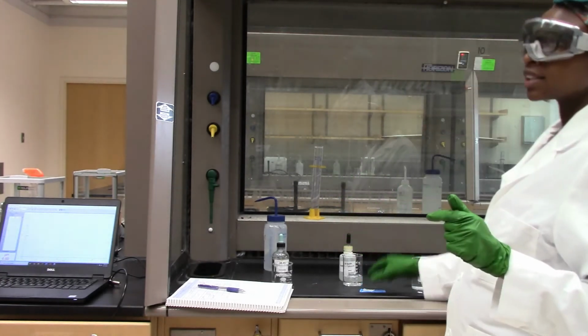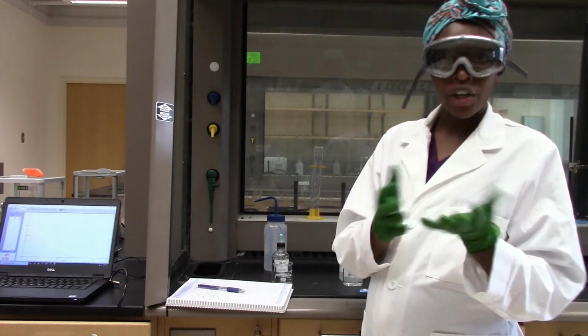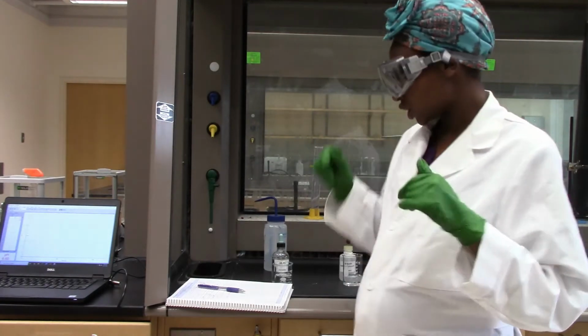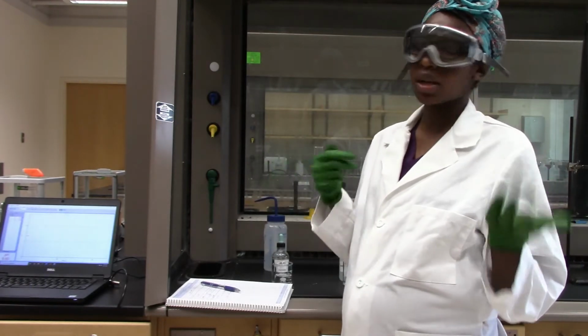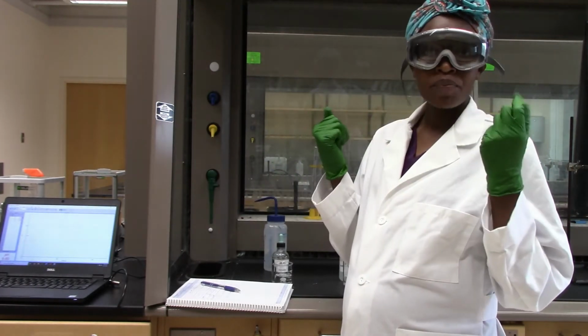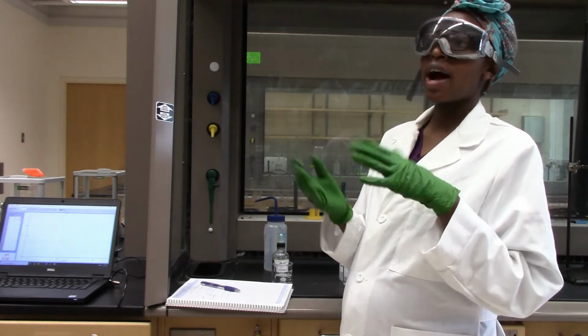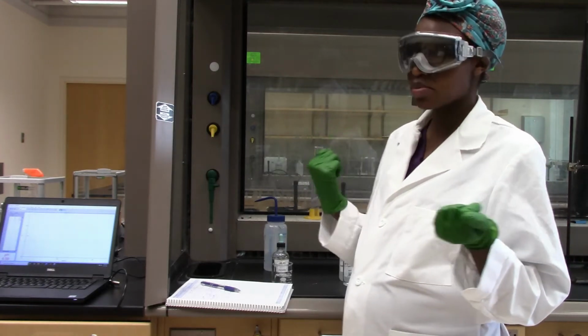So the first thing that I'm going to do is obtain pure deionized water and then measure its pH. There are several ways in which you can obtain the pH of a substance. We have pH meters that give accurate readings. Then you also have pH indicators like phenolphthalein that we will use in this experiment.